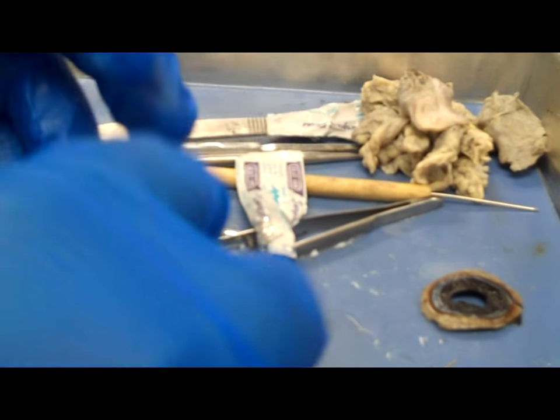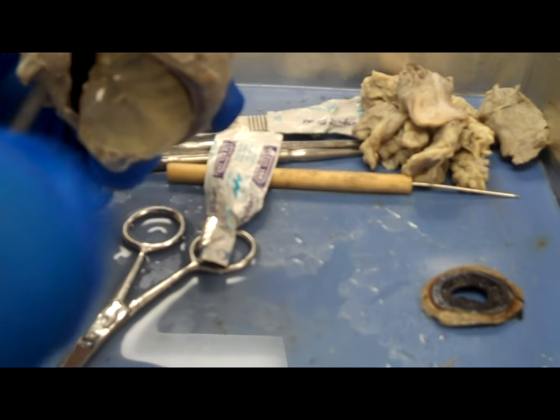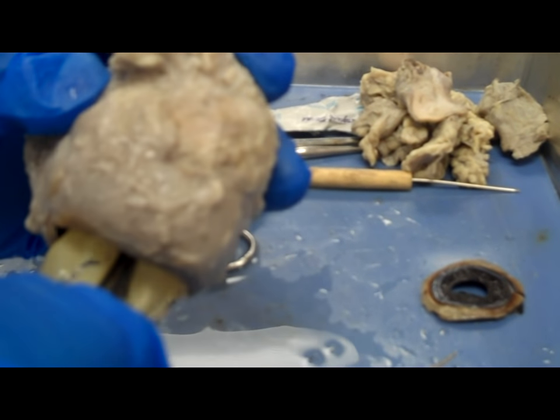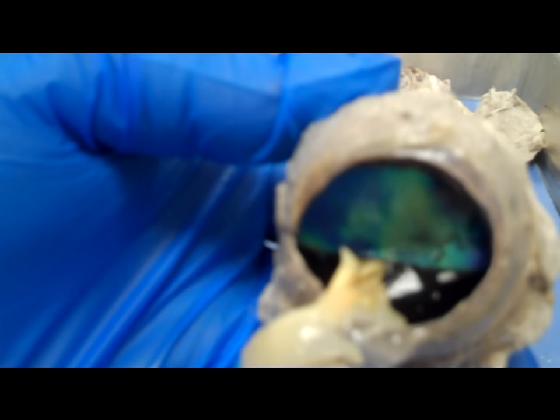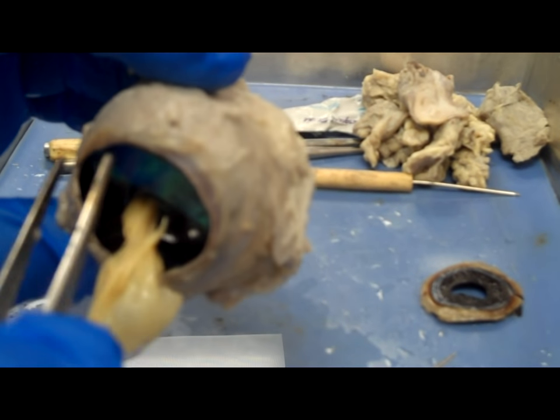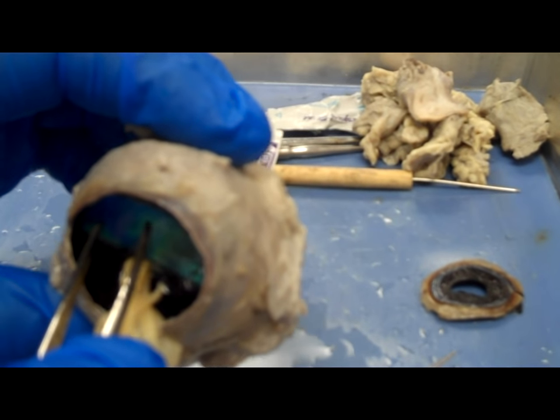The liquid that you see me trying to shake out is the liquid interior portion of the eye called the vitreous humor. You can see a good piece of it. Also, that little white layer coming out as well — that's the retina, the sensory part. The retina is attached to the optic disc, which is attached to the optic nerve. You can see where it's attached to the back of the eye. I'm going to try to remove all of the vitreous humor as well as the retina.